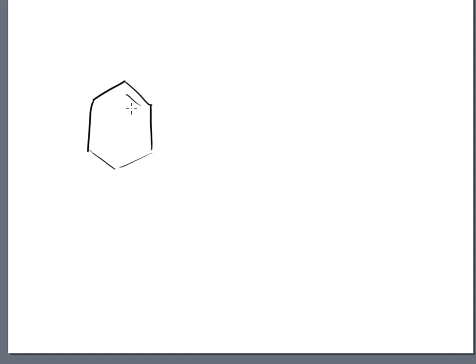All right, so now let's take a look at our last one, and that's C, and this is another ring system. Let me make it match that example problem just so that we're starting on the same foot. So the double was here, single, double, and then off of this was an NO2 group, and on the other side, which is the para position, is the Br group. So we want to do the same thing here. We want to talk about chemical shifts. We want to talk about splitting.